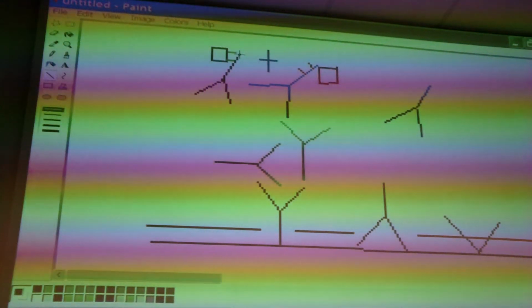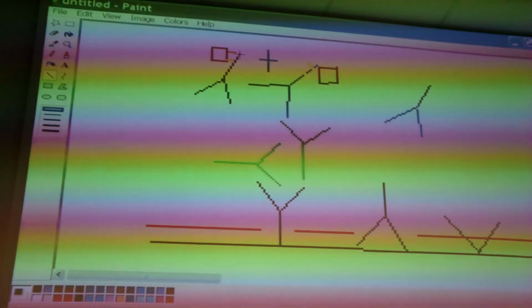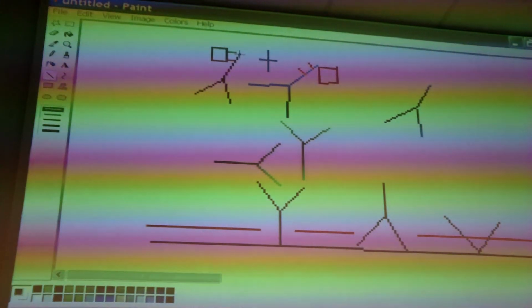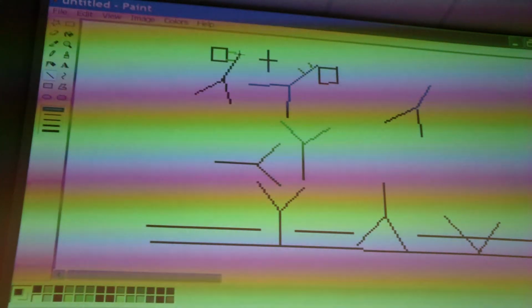Now how do we measure it? First you stop the reaction, then you can measure it with a spectrometer or a plate reader. And how do we then know how much sample was in there? Calibration. Okay, good.